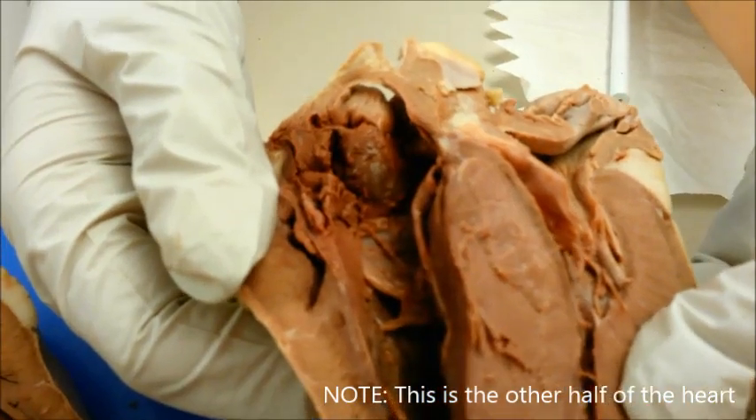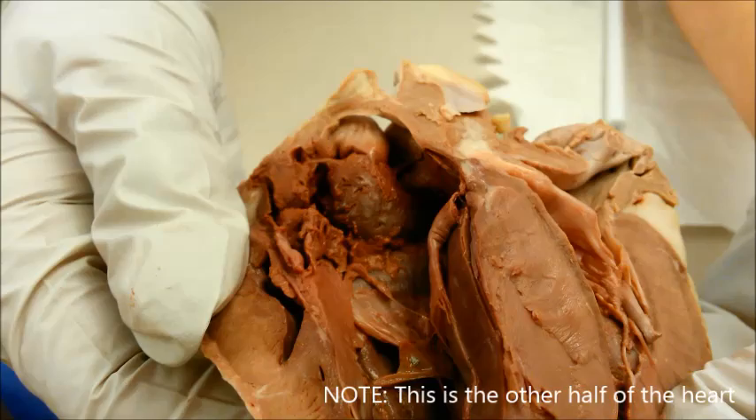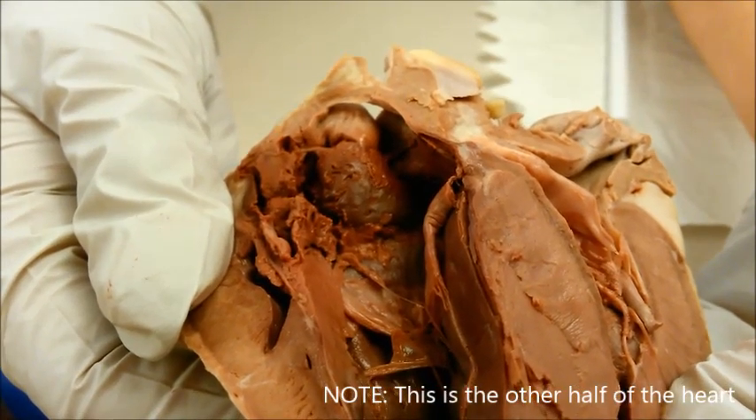The sinoatrial node is a section of tissue located in the upper wall of the right atrium. This node acts as the pacemaker of the heart by setting the rate of contraction.